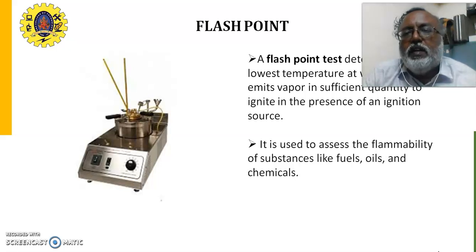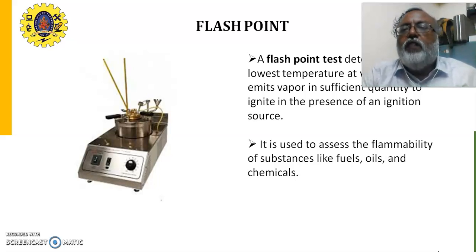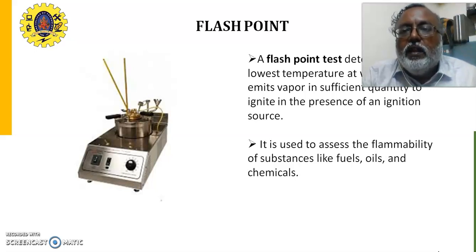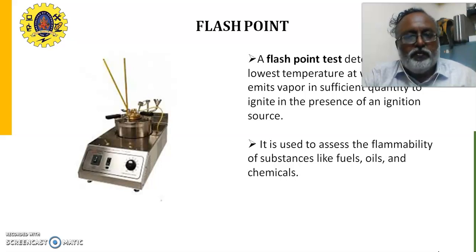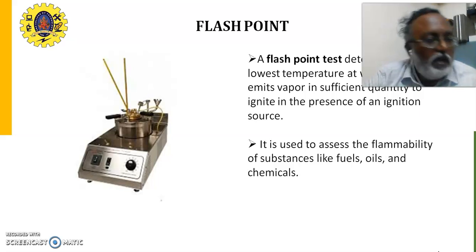A flash point test determines the lowest temperature at which a liquid emits vapor in sufficient quantity to ignite in the presence of an ignition source. It is used to assess the flammability of substances like fuels, oils, and chemicals.